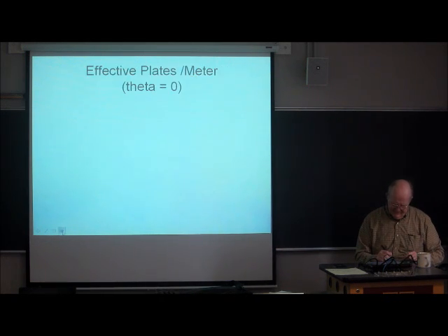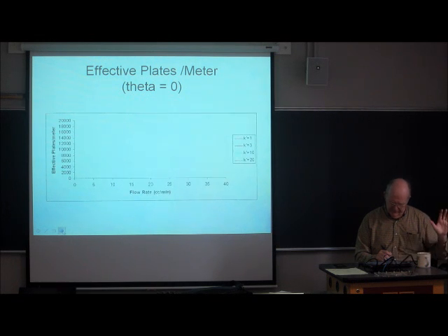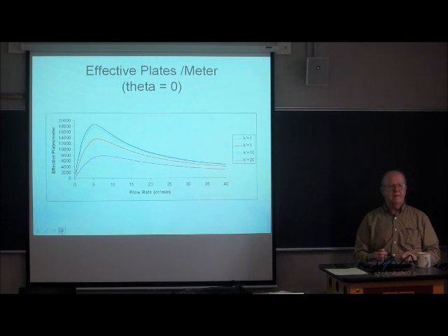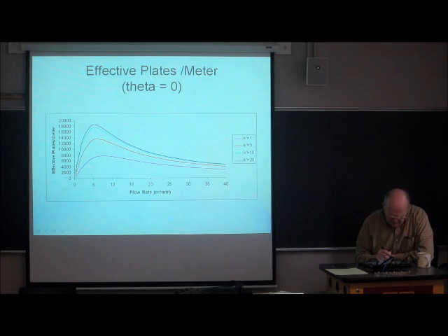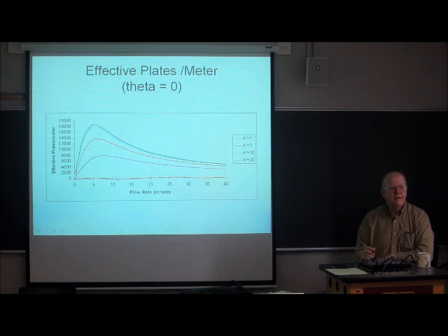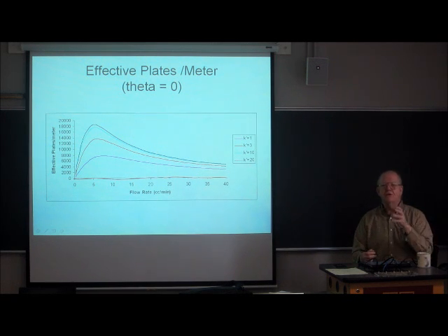Here's the bugaboo. That's K prime 1, 3, 10, 20. I didn't plot K prime 0 because the effective plates, if K prime is 0, is 0. Here's K prime 0. There are no plates. If you don't got retention, you get no resolution. You get no effective plates.